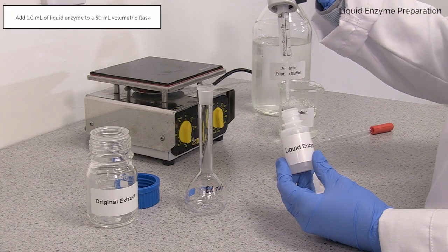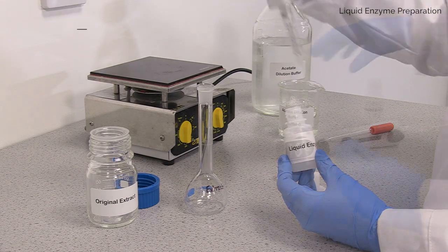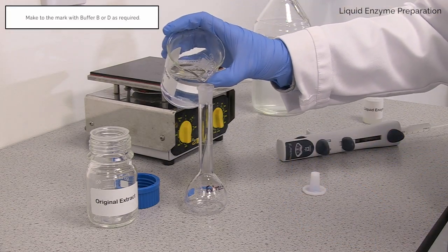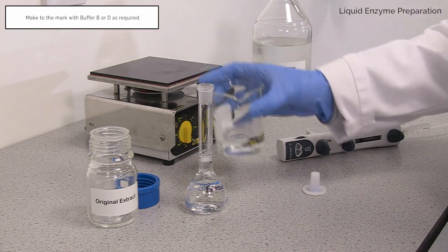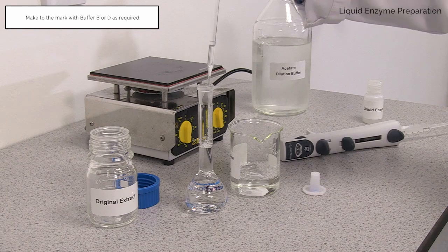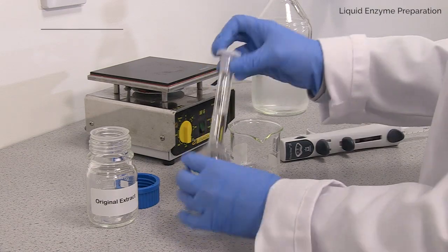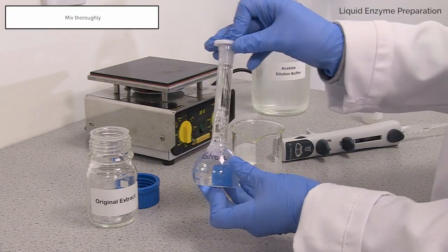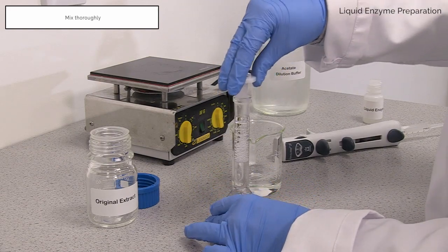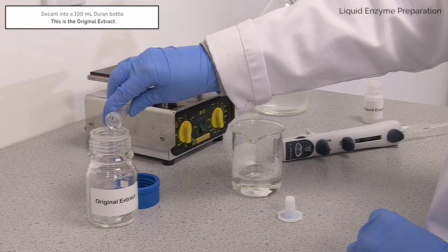In this video, we demonstrate how to prepare both liquid and powder enzyme extracts. Add 1 millilitre of liquid enzyme preparation to a 50 millilitre volumetric flask. Make up to the mark with dilution or extraction buffer, either buffer B or D as required. This is the original extract.